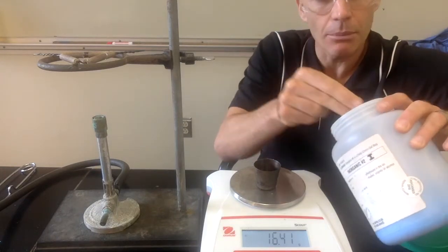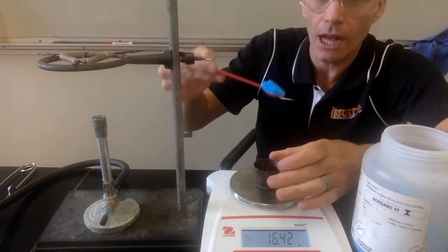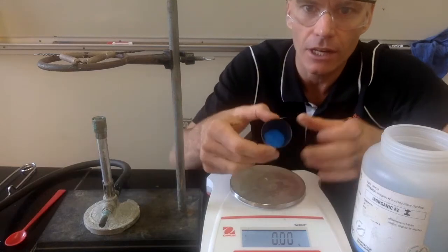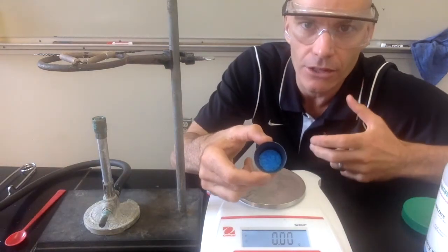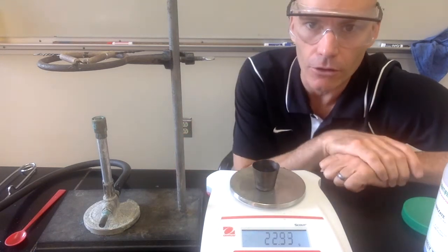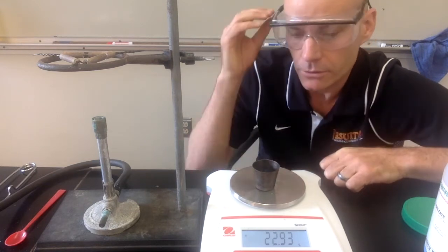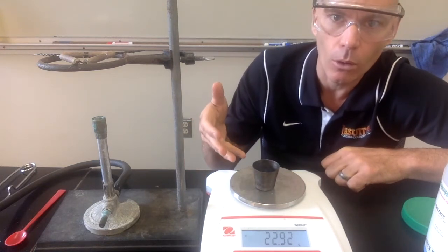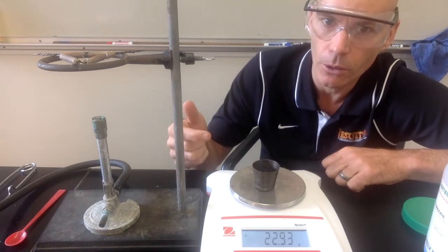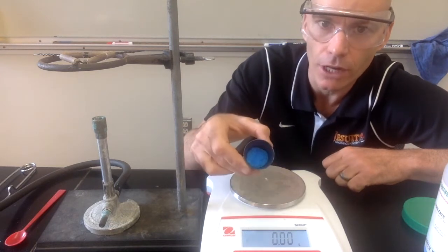Then we'll take a sample of the copper sulfate hydrate. It looks dry, it feels dry, but there's actually water trapped inside. One of the cool things about copper sulfate hydrate is that it has this bright blue color when it's in the hydrate form, when those water molecules are trapped inside. It will turn a whitish-gray color once those water molecules have been removed. We can record the initial mass of the hydrate and crucible, and subtract the mass of the empty crucible to find the mass of just our hydrate.